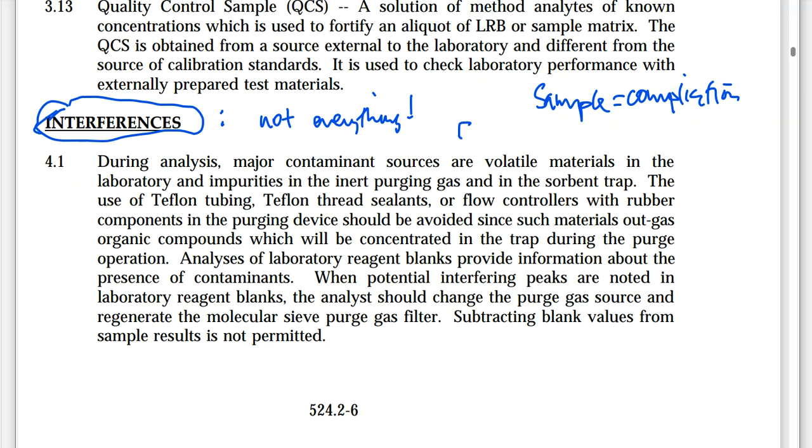Well, most of the time we have an expected concentration that we should see from these values, right? So in section 3, we just talked about all of these standards that we are putting into place to double check everyone's work. The field collector's work, the laboratory work, the instrumentation work, the standard deviation, both in the field and within the laboratory. I mean, it's one thing after another, after another, after another. However, when we do some of these data reports and we look at some of these concentrations that are showing up on those data reports, very often the expected concentration is not matching.